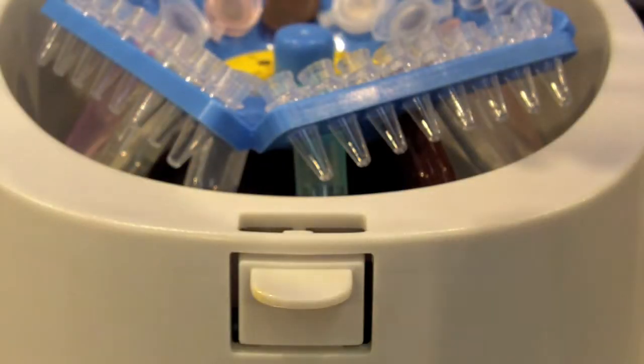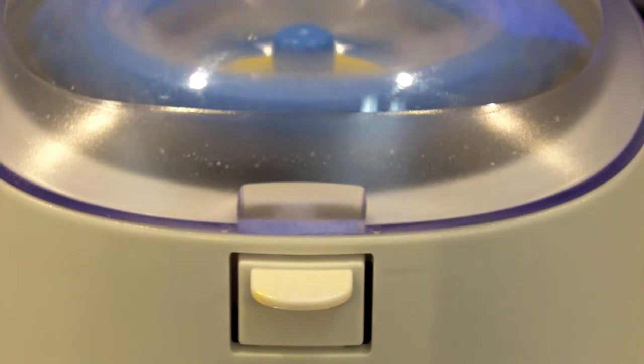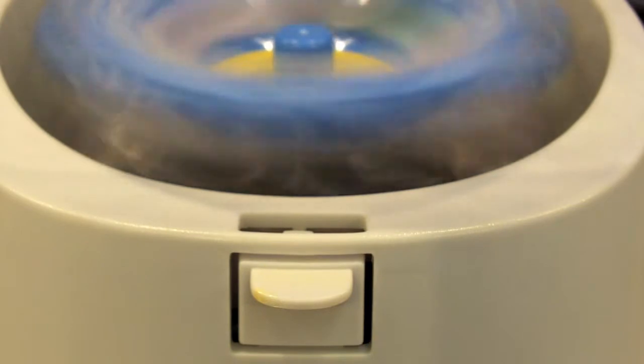The unit comes with a convenient start-stop feature with the lid. When you close the lid the unit will start, and when you open the lid the unit shuts down.